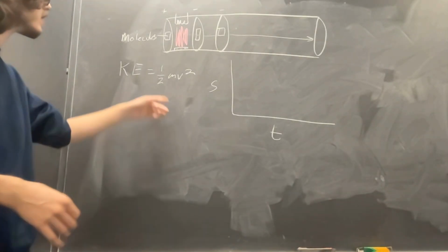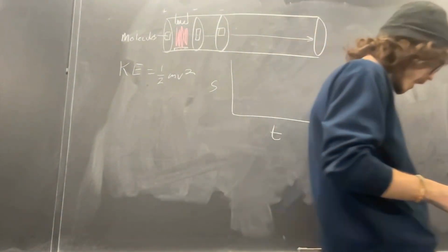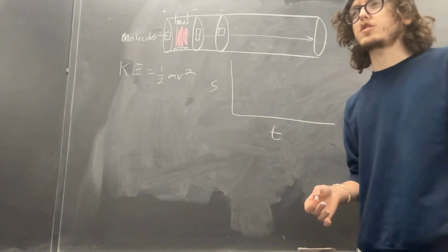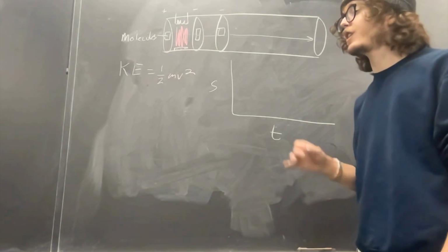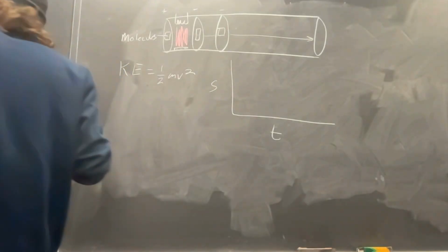And it all comes down to this beautiful equation that we've all seen before, KE equals 1/2 mv squared. Using that idea that we learned from physics, we can separate ions without having to use any magnetic fields or quadrupoles or anything. It's very simple how this is done, and you'll see with MALDI, it's actually one of the better ways to go about this.